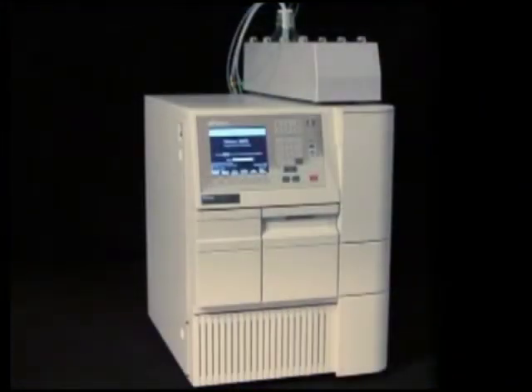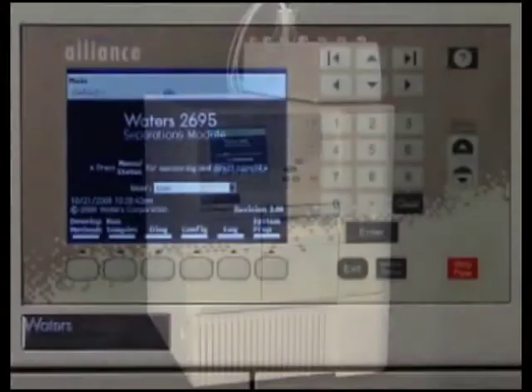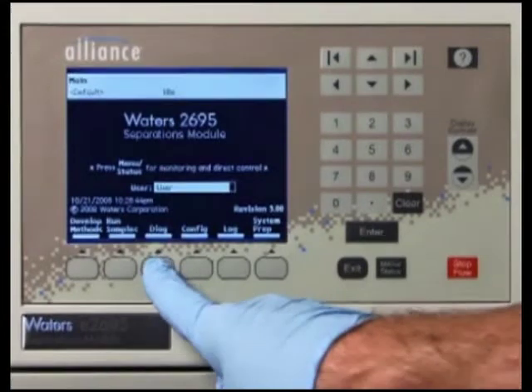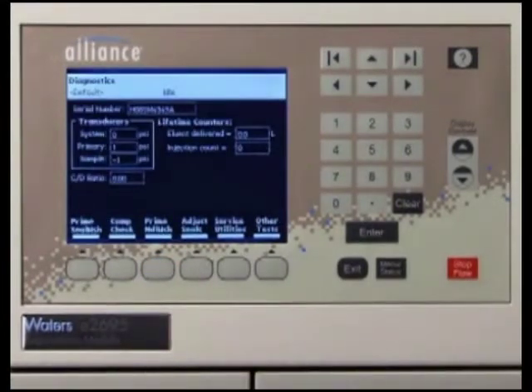Before performing this procedure, ensure that the gradient proportioning valve is turned off to prevent siphoning of mobile phase. To do this, press the Diagnostics key from the 2695 main screen.